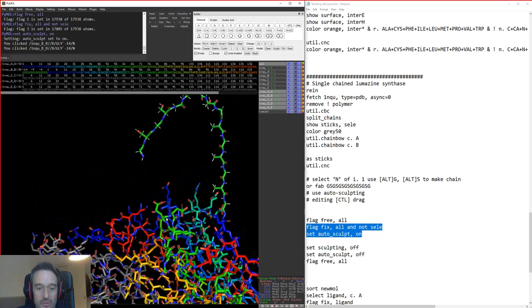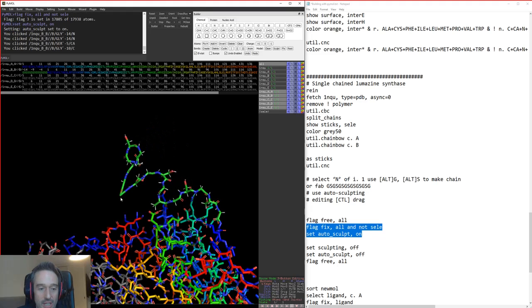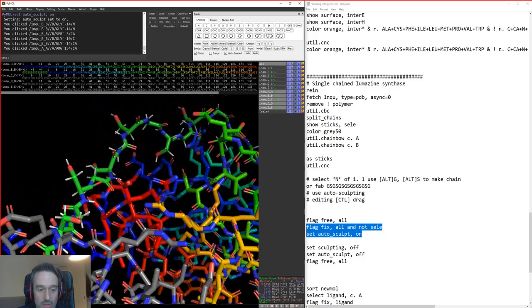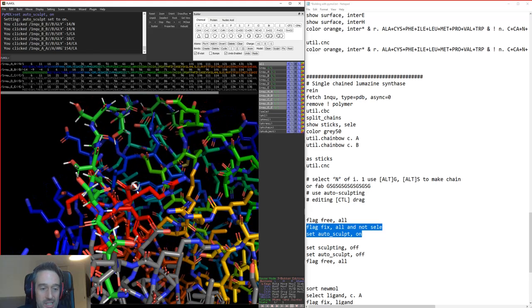So what we can then do is take our peptide chain extension, and we can move that over to the C-terminus of our next residue, of our next oligomer, which is over here. So this is our OXT atom again here.